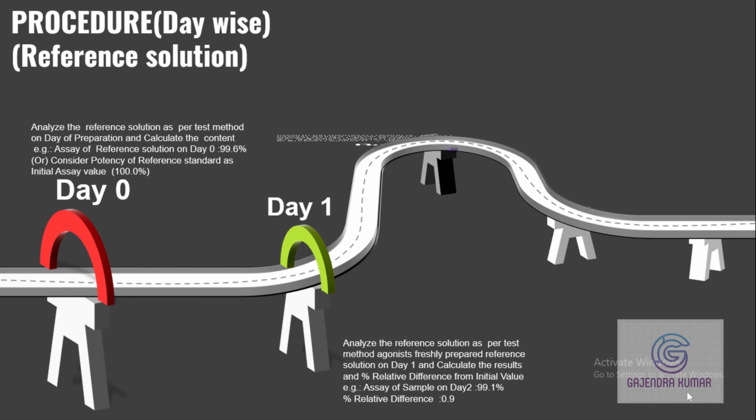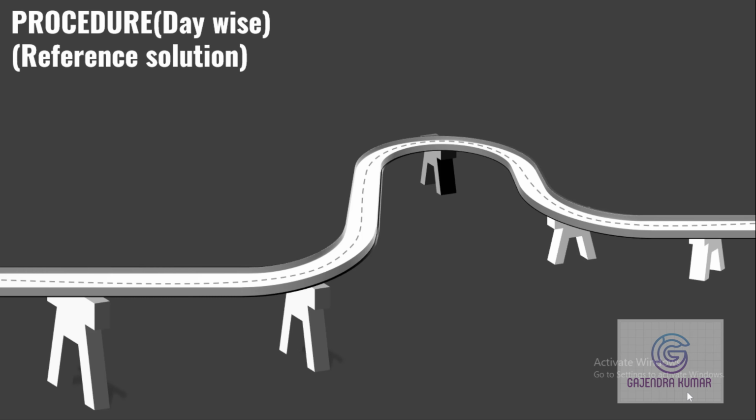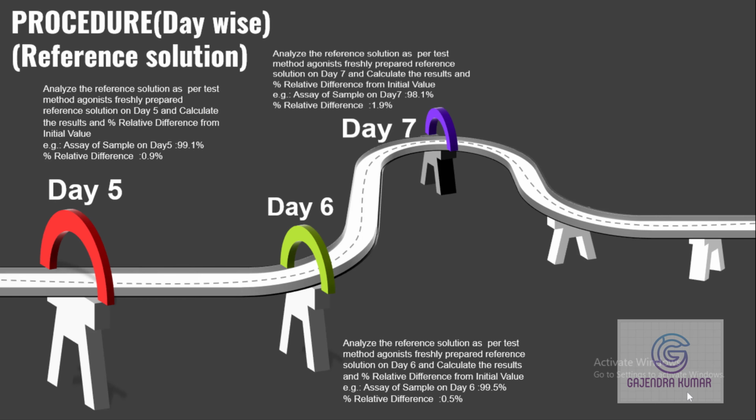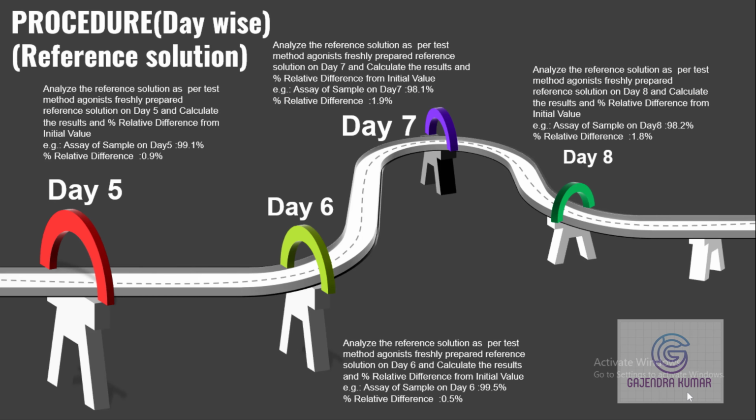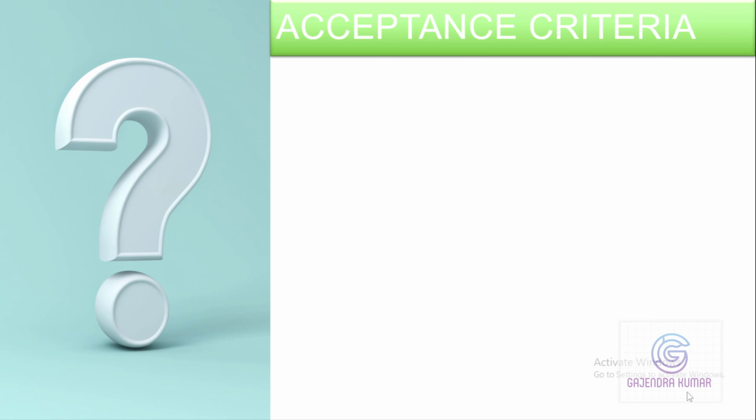So analyze the solution on day 1, day 2, day 3, day 4. Follow the same procedure on the subsequent days and calculate the content and the percentage relative difference from the initial value. So what is the acceptance criteria to establish a solution stability?